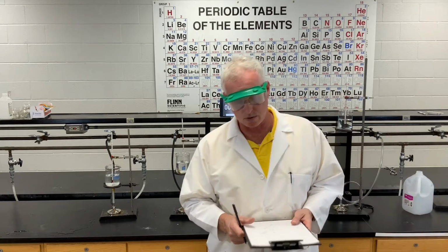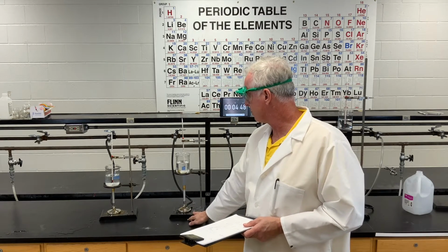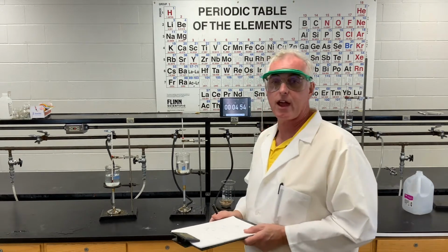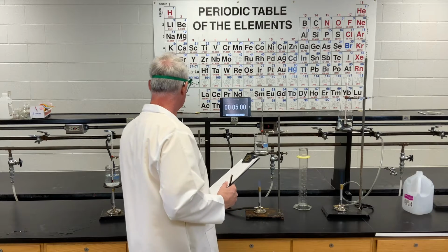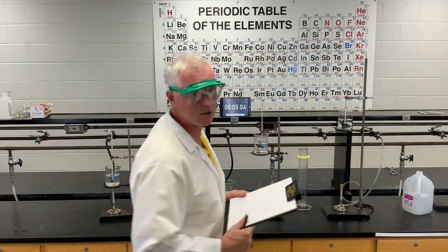Our target temperature was 90 degrees, and height number 2 reached that at 4 minutes and 30 seconds. So I'm going to turn this one off. And we'll see how the others do, how much longer they take.